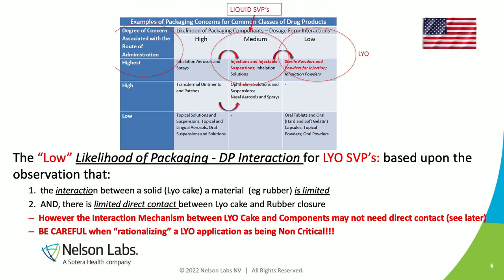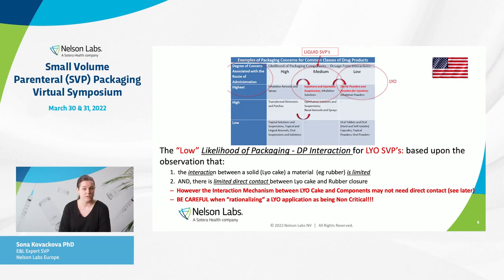And this was based upon the observation that the interaction between the solid lyo cake and the material is limited, and that there is a limited direct contact between them.